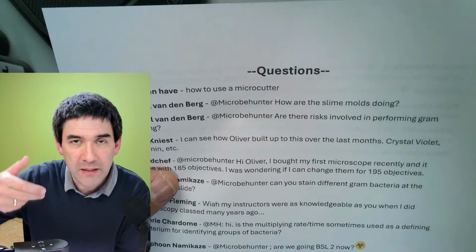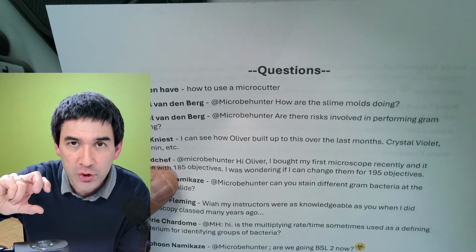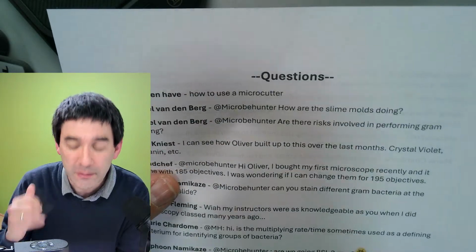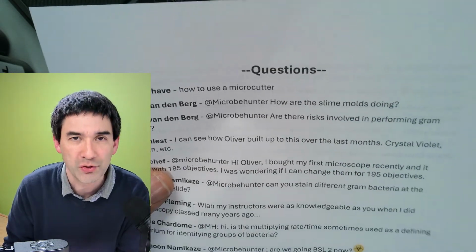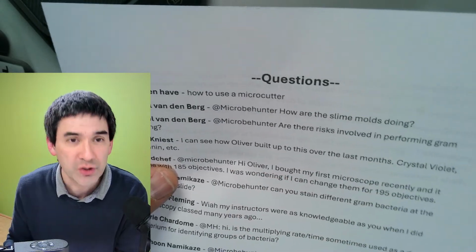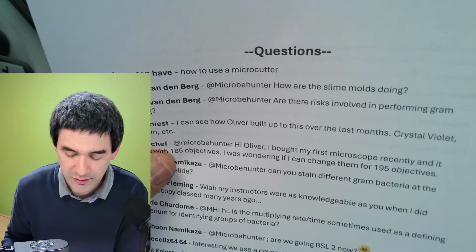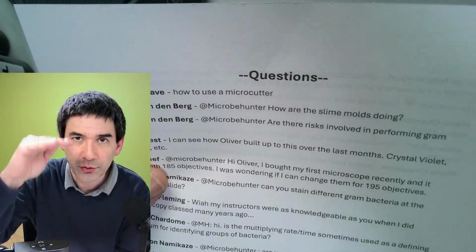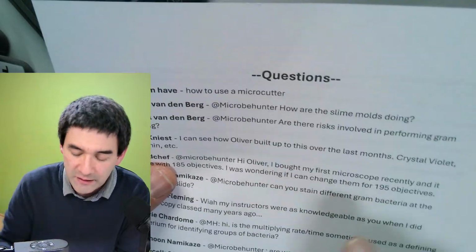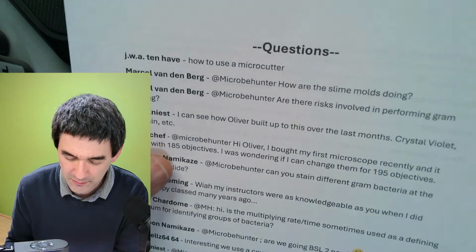This means if you're able to lower the stage sufficiently, so that the larger objectives fit, then it should be possible. The question is if it's worth it or not. It depends really a lot on the space of the stage, whether you're able to fit in the larger objectives.